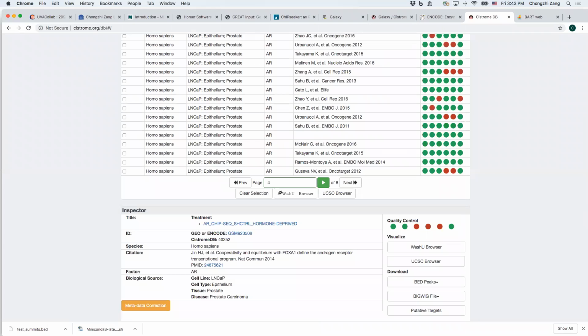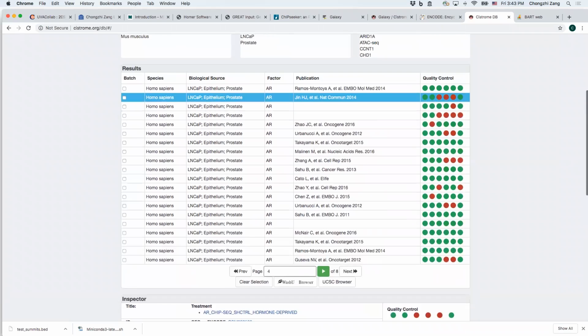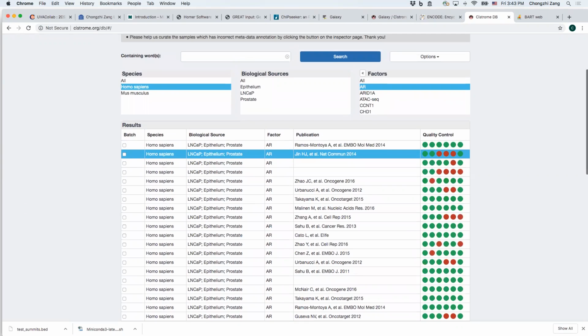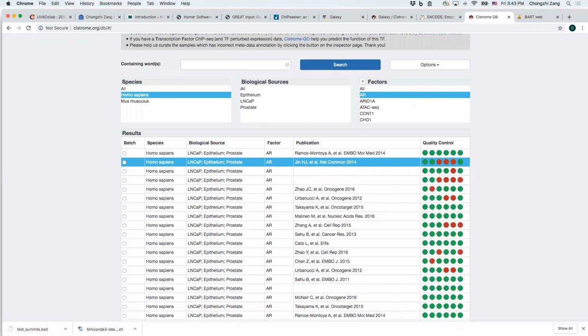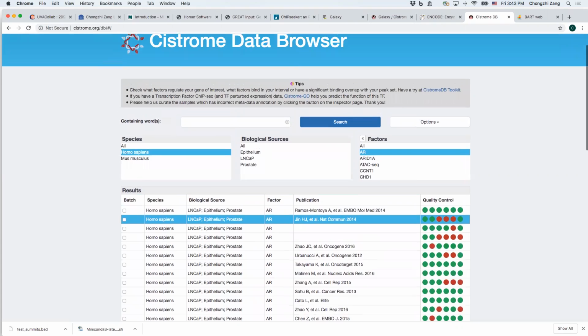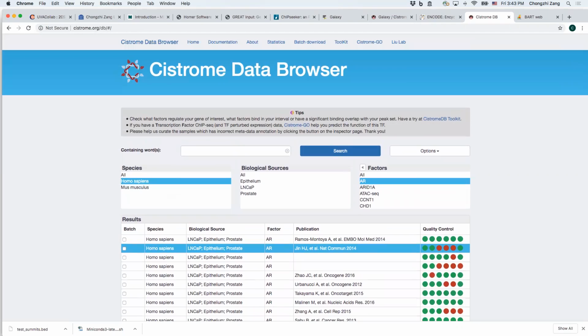so for example, when a motif is very complex, like P53. In fact, in our first high resolution ChIP study, we did CMYC, P53, and SP1, and Kevin Struhl did the ChIP. And I asked him why he picked those, and there was no biological reason. He said P53 won't bind very much, SP1 will bind medium, and CMYC will bind a lot.